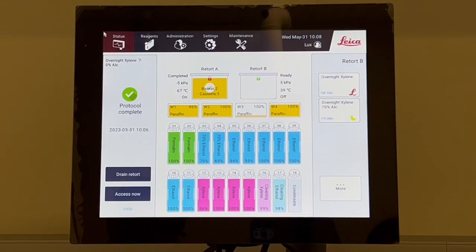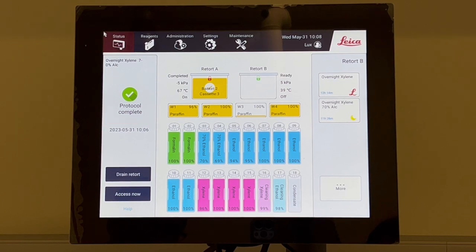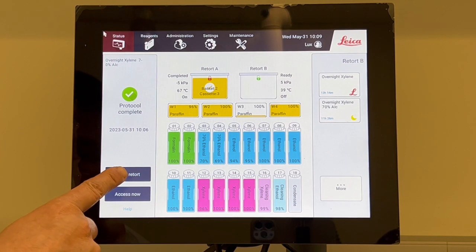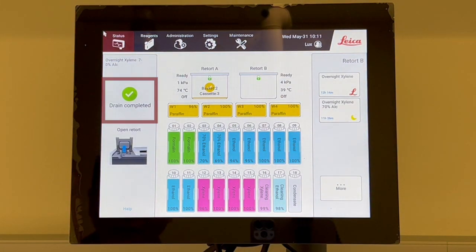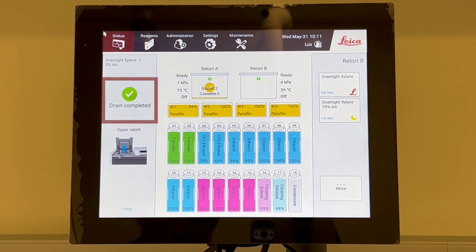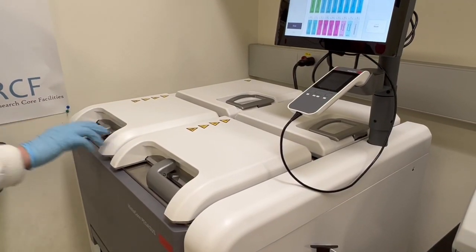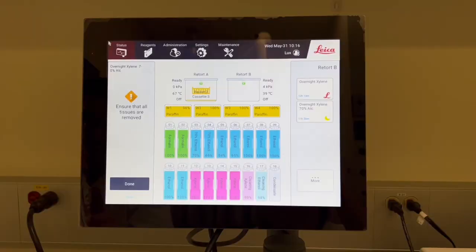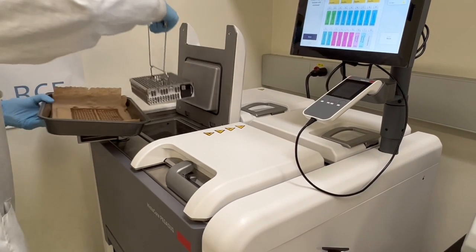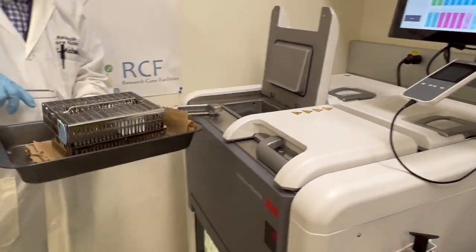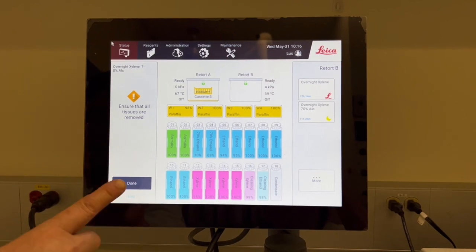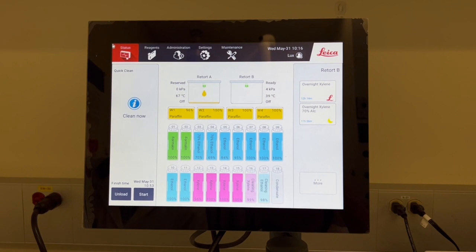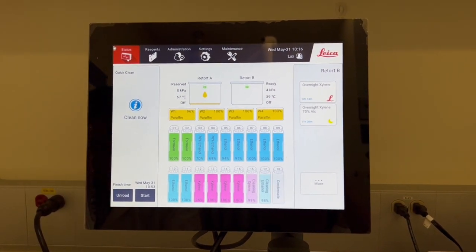When the protocol is finished, the protocol complete dialog box will appear, with a notification saying protocol complete and an alarm sound. Then, tap drain retort to drain the retort. When the dialog box drain completed and open retort appears, please open the retort. A message will appear prompting you to remove all tissues. After this is completed, tap done. Please do not tap done until all the baskets have been removed from the retort.